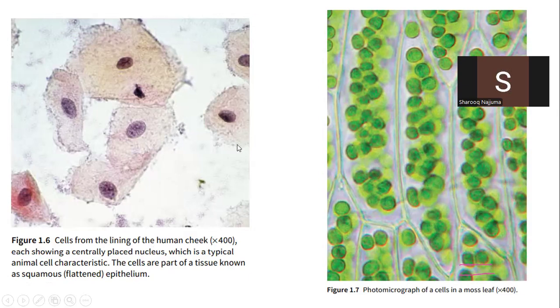These are diagrams from microscopes, and they're from a light microscope. So these are cheek cells from a light microscope. Remember, I told you that a diagram or a photograph from a light microscope is called a photomicrograph. So this is a photomicrograph of human cheek cells. Hope you can see the cell surface membrane, the nucleus, the cytoplasm.